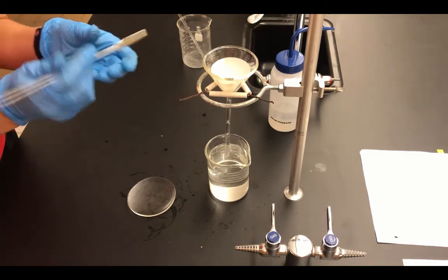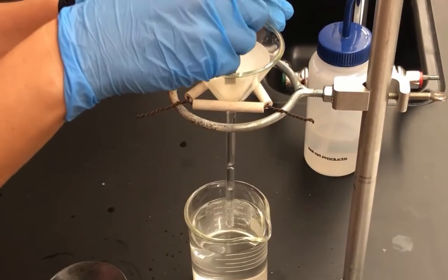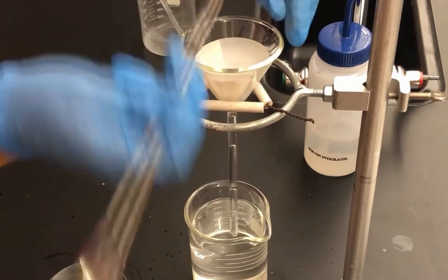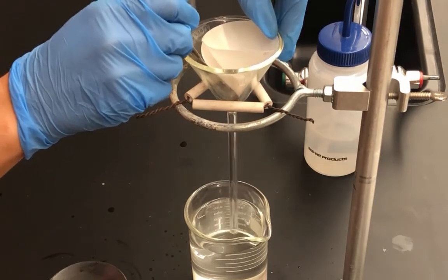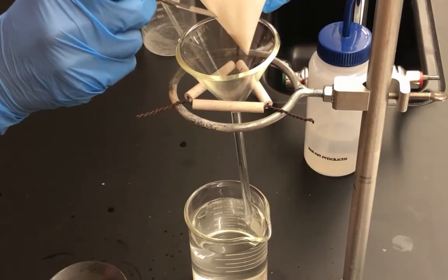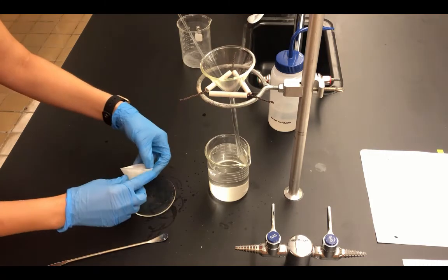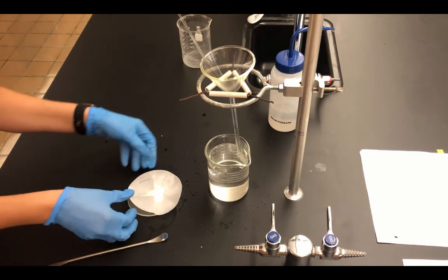And so what I'm going to do is take the flat side, and I'm going to slowly go around the filter paper just to gently release the seal. And then, since I have gloves on, I'm going to just use my thumb to slowly pull out the filter paper, being very careful to not touch the very bottom where the solid might be. And what I'm going to do is then move it over the watch glass. There is still some water, so I'm just going to lay it out.